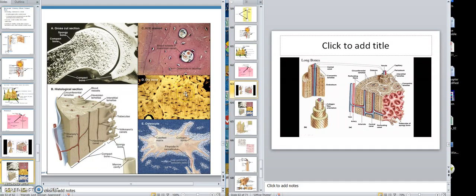Inside a lacunae you would have an osteocyte. The canaliculi feed into the lacunae, and in the lacunae would be an osteocyte. See here's that osteocyte right there. So that cut-out area of bone there is the lacunae — look at those wiggly lines coming from the lacunae, those are called canaliculi.